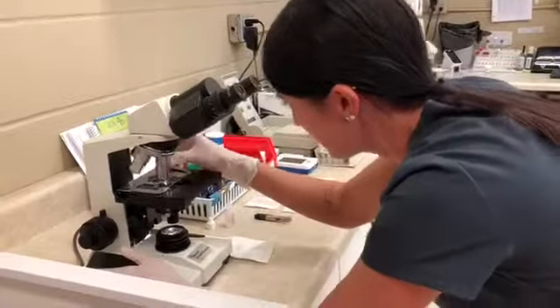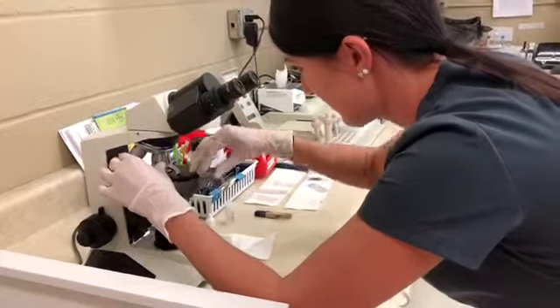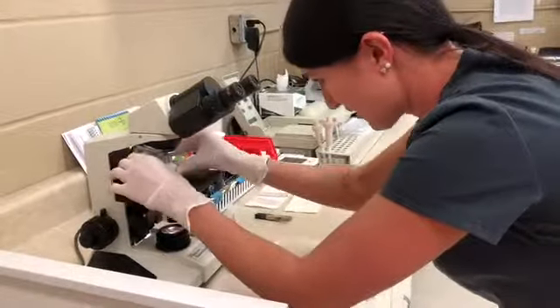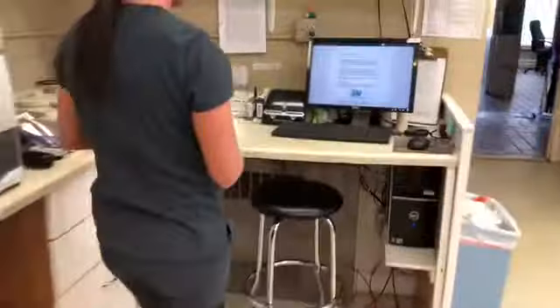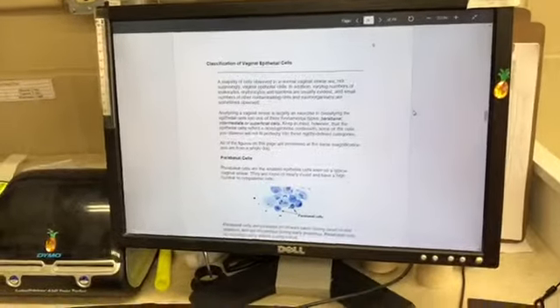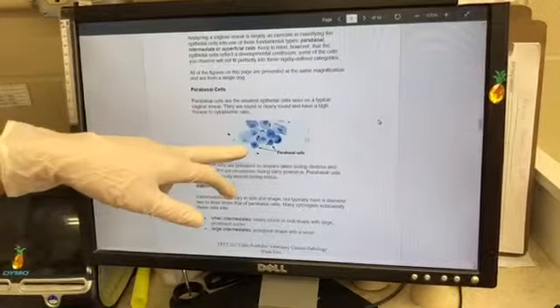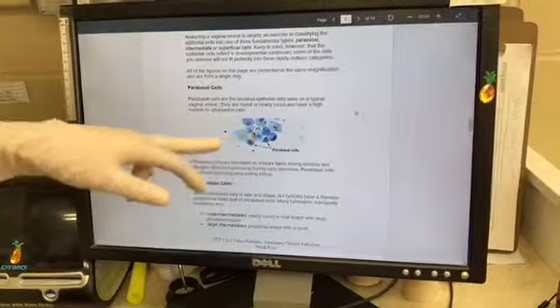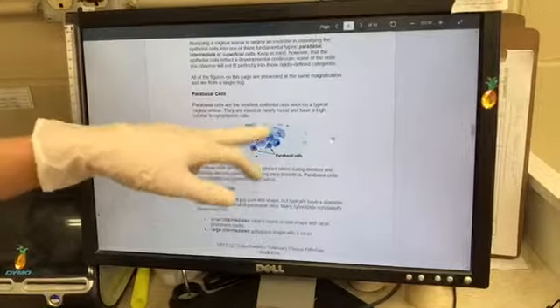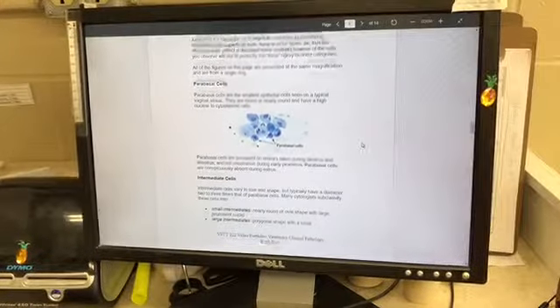I have a good representation of what's on the slide here and what we're looking at. So let's head on over to the computer and I'll show you a few different things. The first thing we're going to go over is some cells seen on vaginal smears. These are the parabasal cells — the smallest epithelial cell seen on a typical vaginal smear — and I did see some of these on Jamie's vaginal smear.